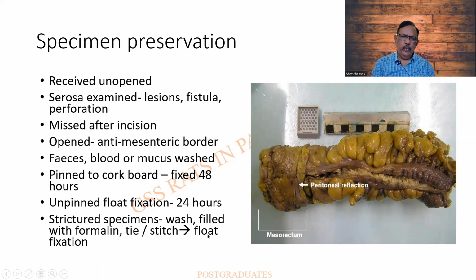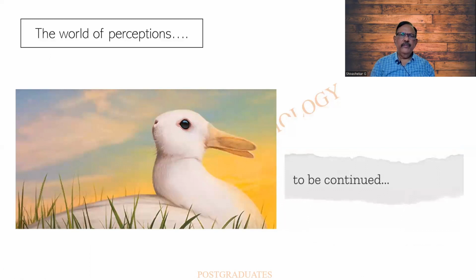Strictured specimens are again washed and kept afloat. We are living in a world of perceptions. I would like you to decipher what is there in the picture. To be continued in the next class.